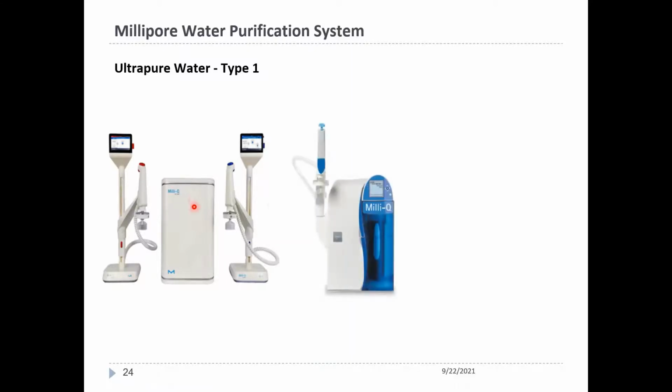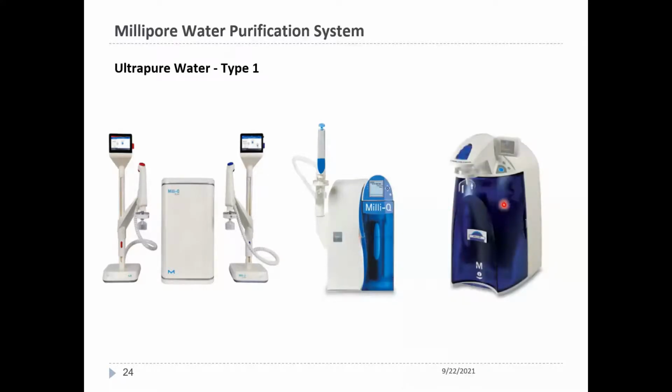Then we have the MilliQ Direct. So the MilliQ Direct, as the name suggests, takes the water directly from the tap and then gives you ultra pure water. And then you have another MilliQ Direct, also a smaller volume.